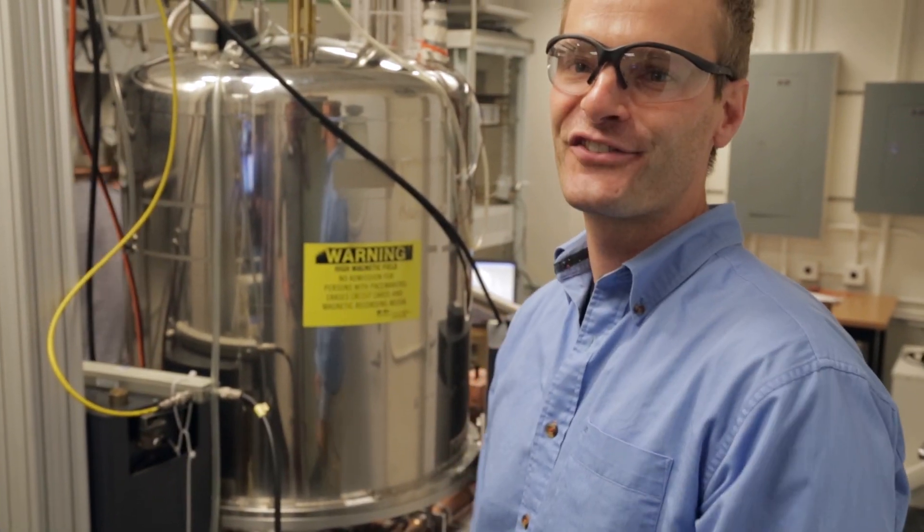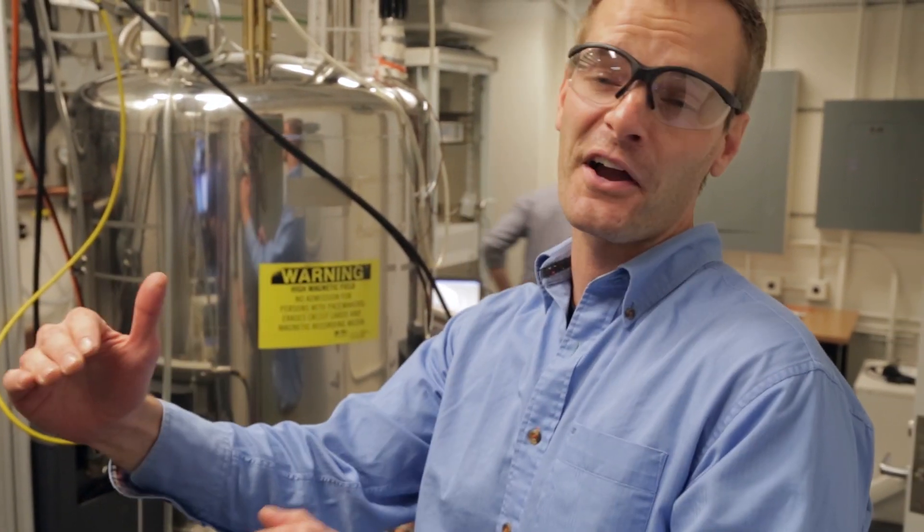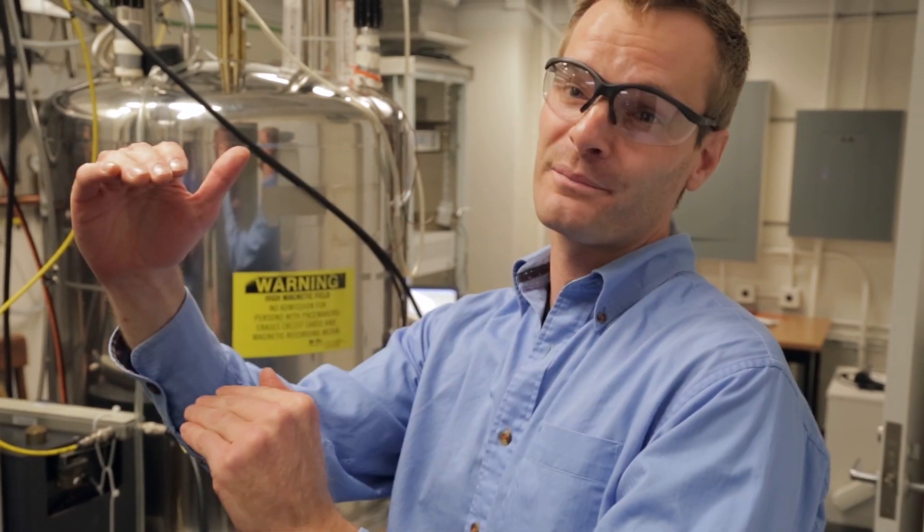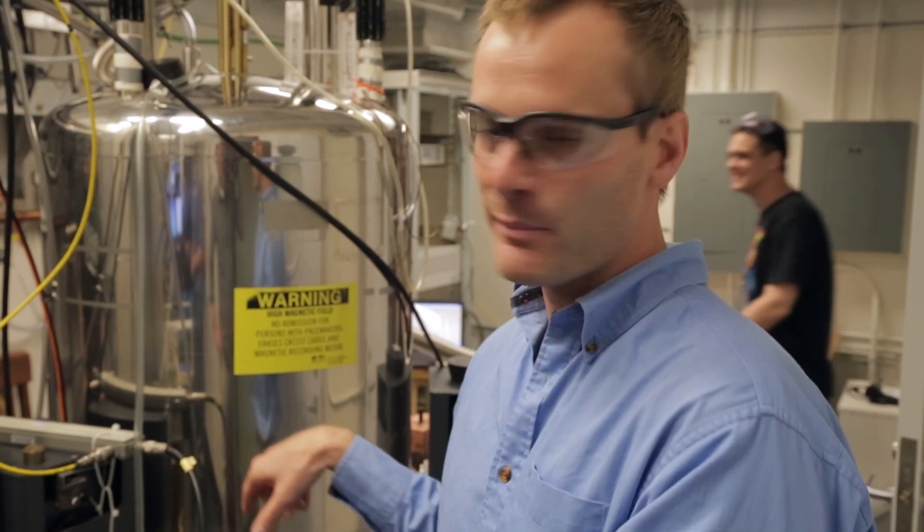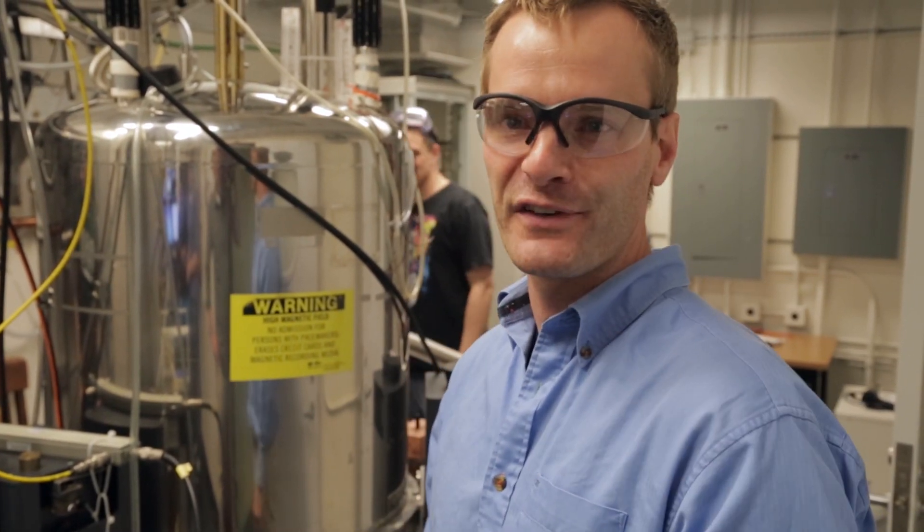We just turn it on and the signal is about a factor of 50 times higher than it was before. If you shine the microwave from the gyrotron we built onto the sample, the NMR signal is about a factor of 50 bigger.